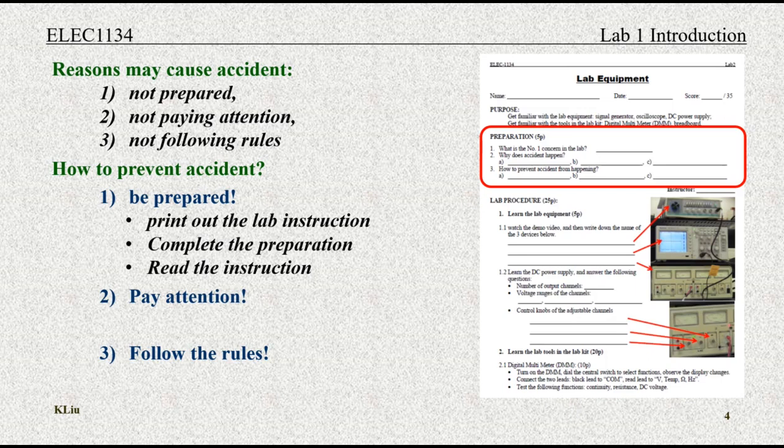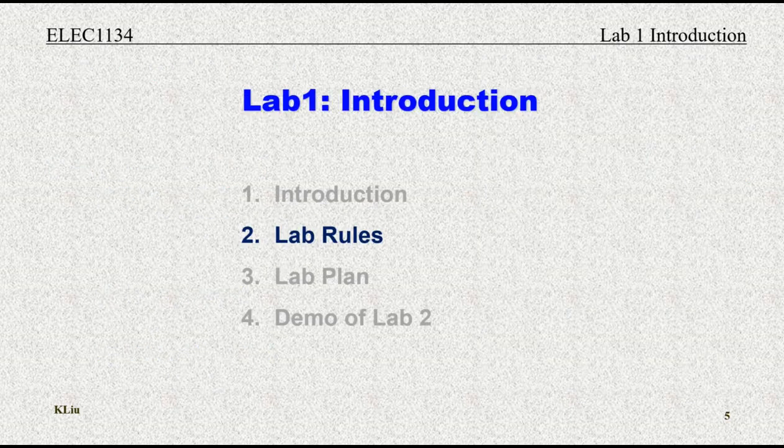What does it mean by paying attention? Follow the lab instruction step by step. Learning by doing. What does it mean by following the rules? We need to follow the lab rules carefully. Let's take a close look at our lab rules.